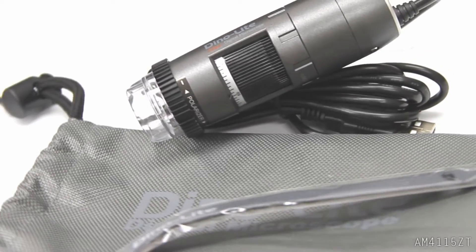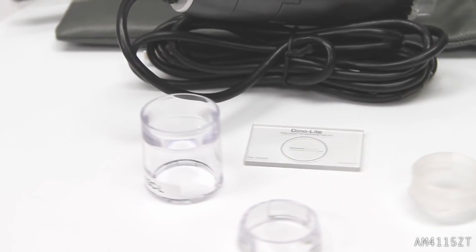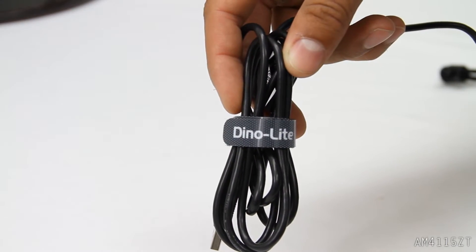The AM4-115ZT includes a carry pouch, cable velcro, interchangeable caps, and measurement calibration slide.